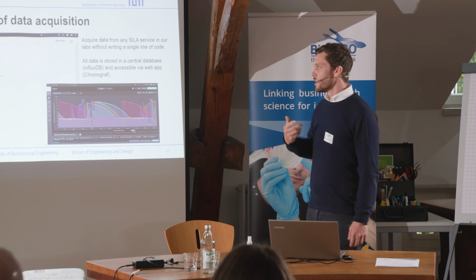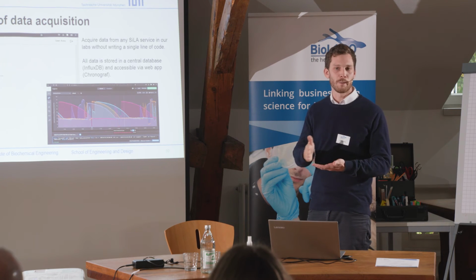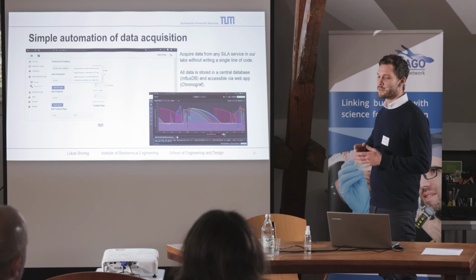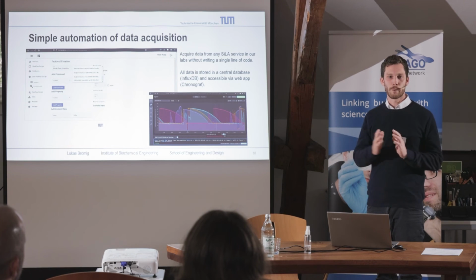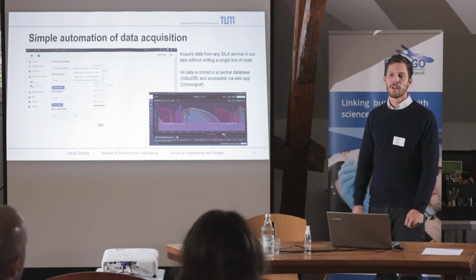And if it's just a command, you can, for example, set an interval at which it's being polled and do long polling. And then in our case, we set up a database where it's all just being pushed to, and like that, we have an interface, a dashboard, where we can access all the data from all those different devices, which we previously had to collect running around with USB sticks.